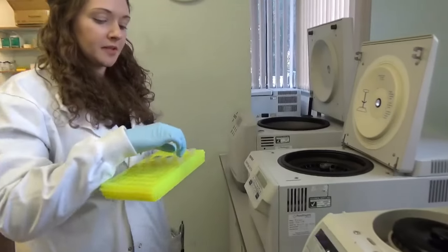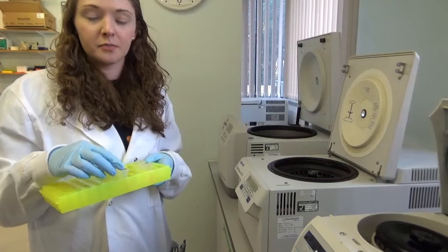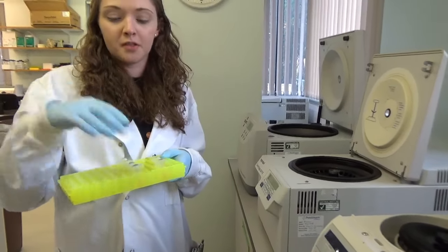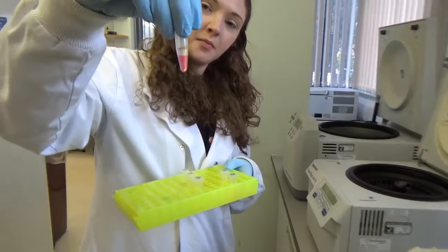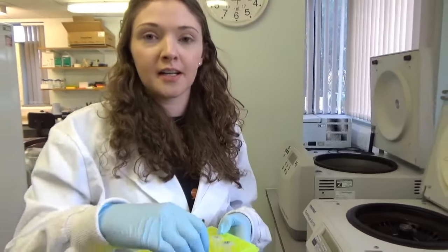Okay, so I'm taking samples out of the centrifuge. Basically what I've done is, these are cells from kidneys. And I've put them in TRIzol, I've dissolved all the cell components, and the RNA, I don't know whether you can see the top. So the RNA is the clear liquid at the top, and that's what I'm going to take off the sample. And I'm going to leave the pink stuff because that's all the DNA and all the other cellular stuff.